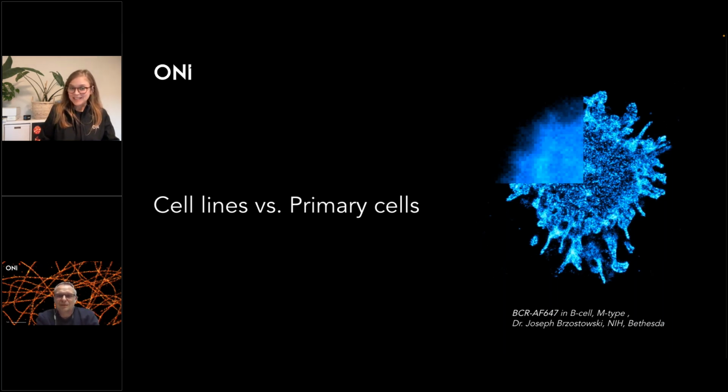So glass bottom it is, but what about surface coatings? Can I use PLL or collagen? Is that compatible? Yes, that's actually a good point, especially from the point of view of primary cells, or even cell lines, which are cells in suspension. When I worked in the immunology field, you very commonly use immune cells, so T cells, NK cells. You can also use macrophages and dendritic cells.